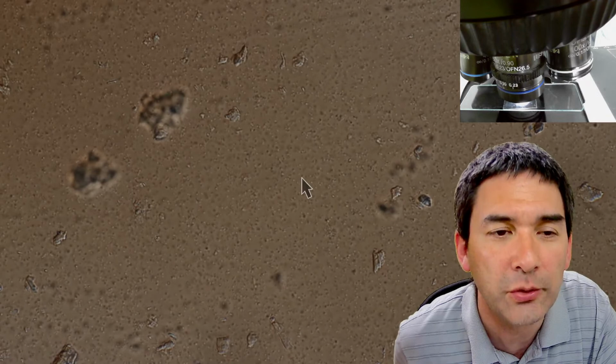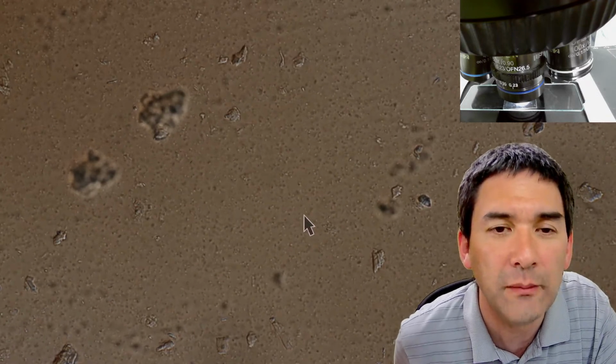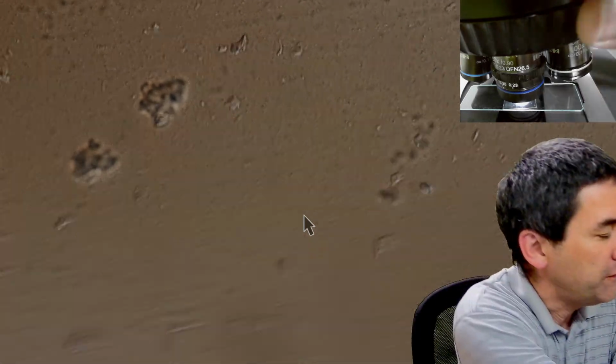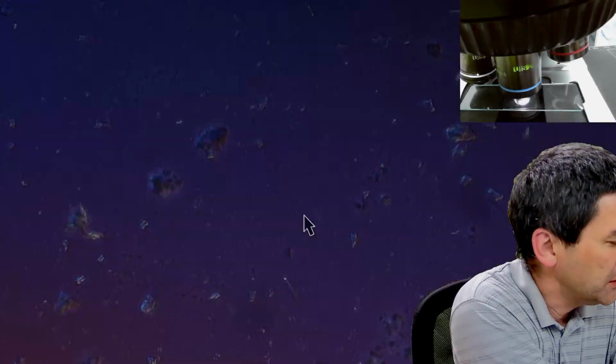I don't even know if you're able to see it on YouTube in a live stream very well, if the image quality is good enough. I could try phase contrast now. Let me try phase contrast 40 times, but it's still a little bit small, I would say.